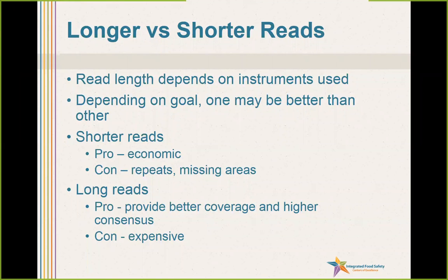For public health, long reads are only used for niche purposes, such as generating high-quality assemblies for validating sequencing protocols. The reason why we don't use long-read sequencing for outbreak surveillance or foodborne pathogens is the cost and comparatively high error rate. This might be overcome by increasing coverage, which in turn would make it even more expensive for most labs. The type of sequencing that is currently relevant is short-read sequencing, and the MiSeq is the instrument most labs are using to achieve this at this point in time.